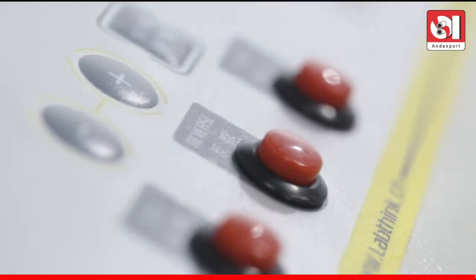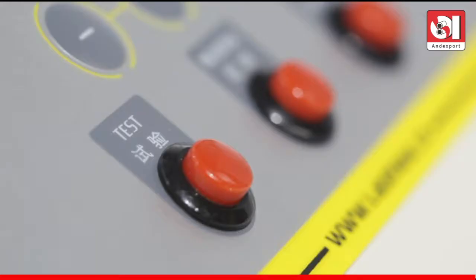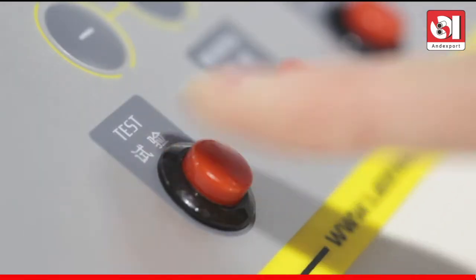This entire process is monitored and controlled by high-precision manometer and microcomputer.